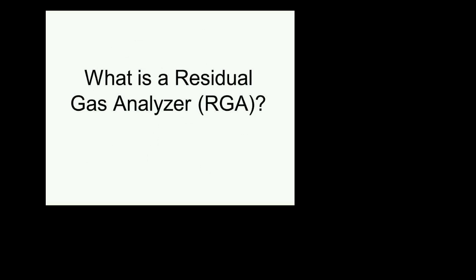All right. So what I want to do now is start focusing on the hardware. So literally, what is a residual gas analyzer? What are the parts of the residual gas analyzer and how does it work?